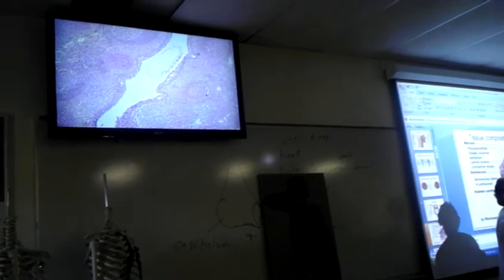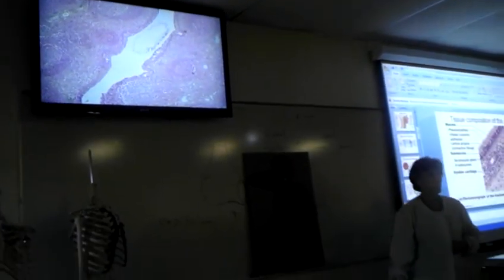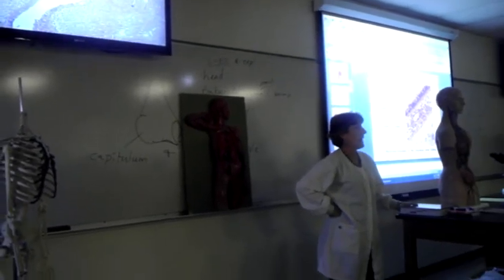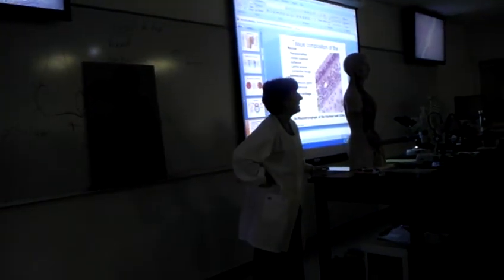So on the lymph node, you're going to stick to the cortex, medulla, follicle, capsule, trabeculae, all the ones we had just done. Okay. And the only thing I'll use adenoids or tonsils for is the crypt. Okay.